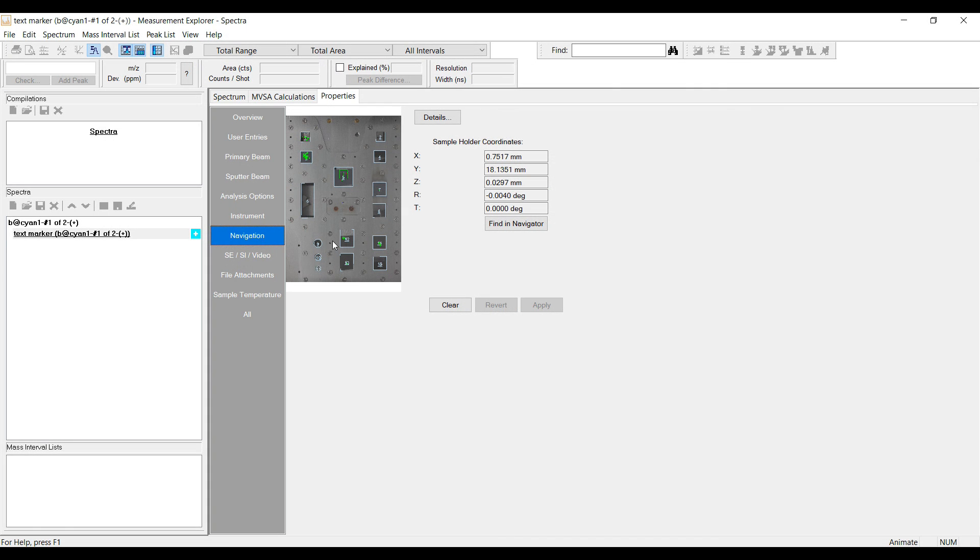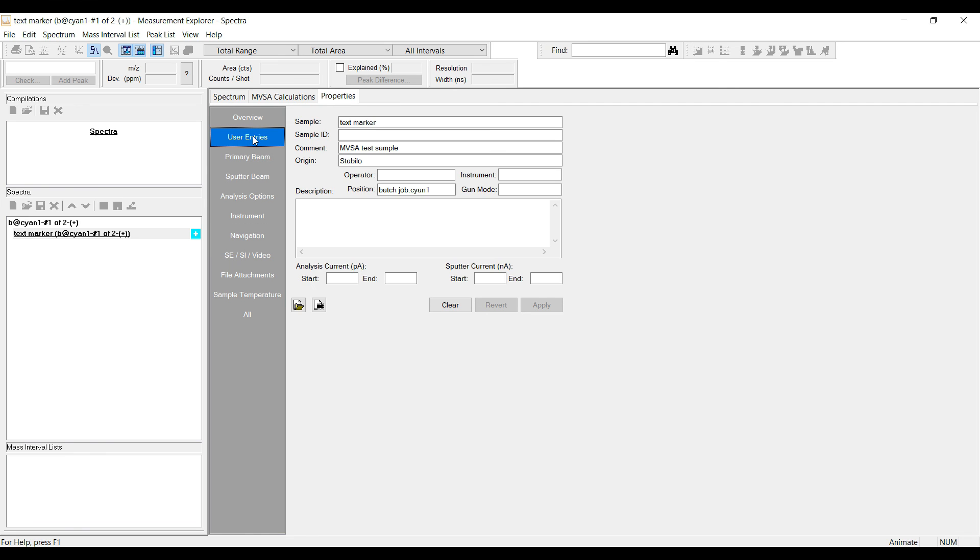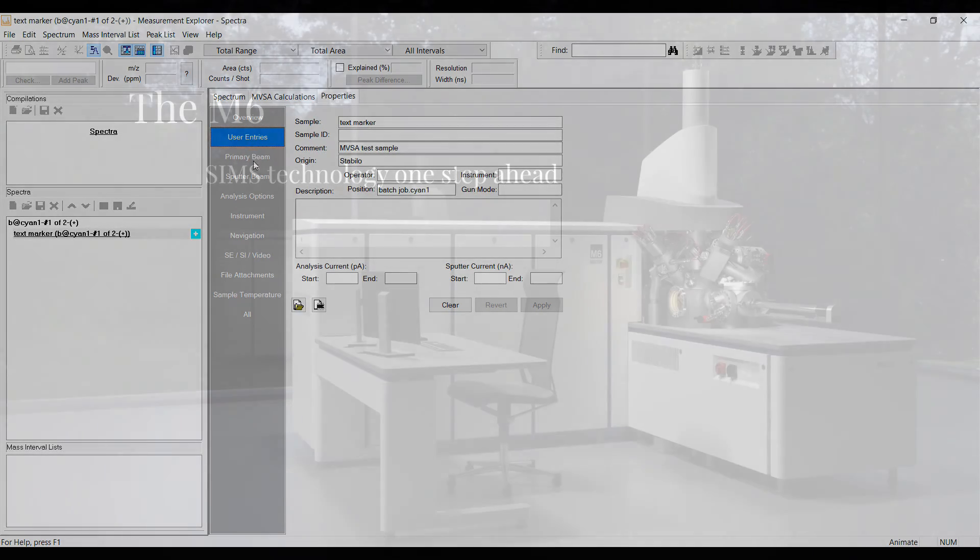In the measurement header you will find the photo of the sample holder with details about the measurement positions, other samples on the holder and so on. In the user entry section you will find the information about the measured sample.